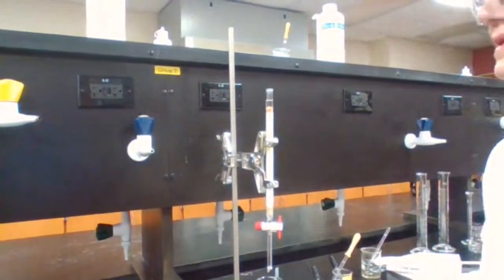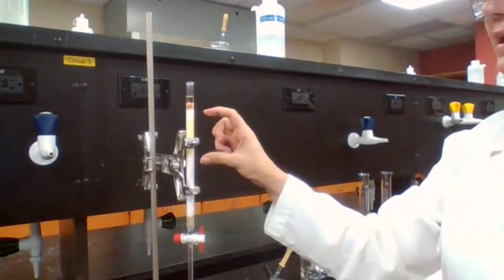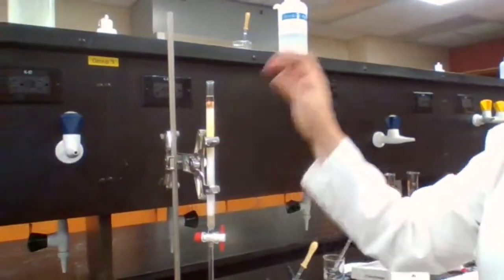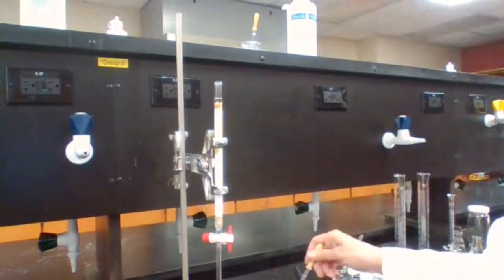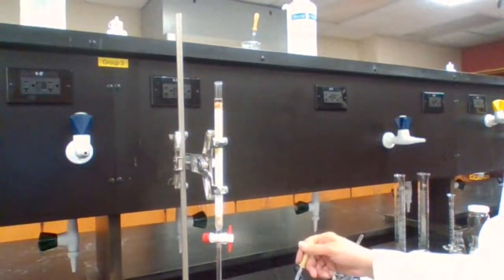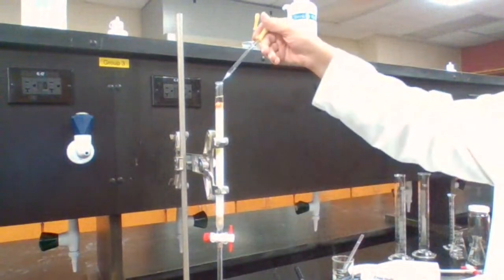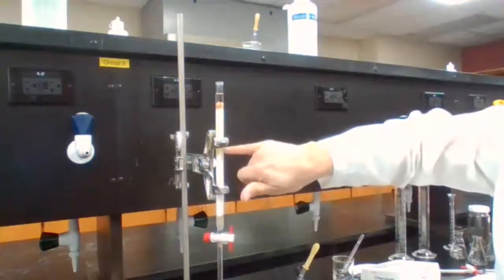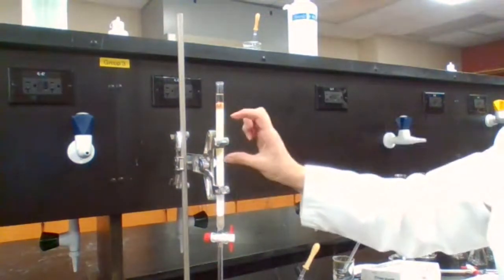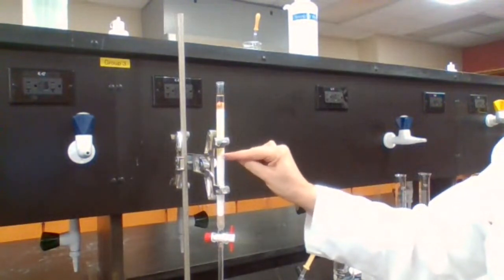Until a yellow is noted. So the yellow color is visible. It's been visible since the beginning of the elution, but it's not very distinct. That means it starts here and comes down here, where it's more distinct, and it kind of levels off.